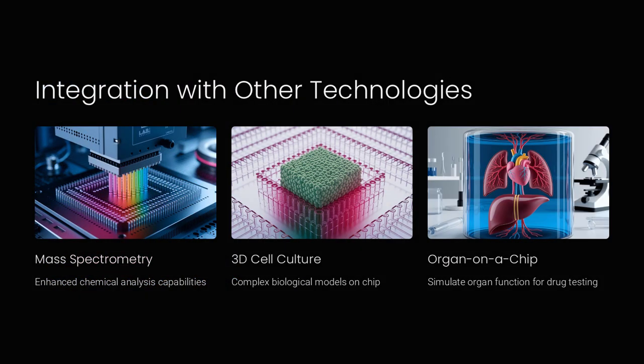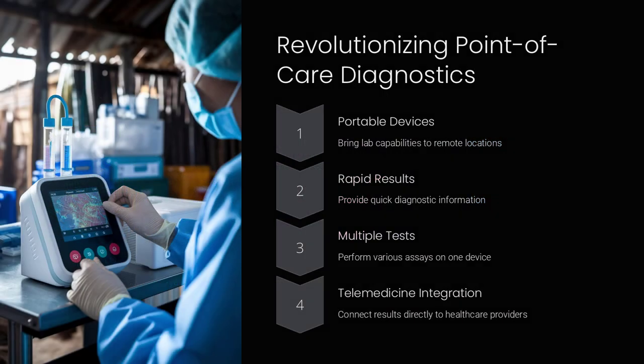Digital microfluidics has broad applications in both biological and chemical analyses, ranging from DNA amplification to enzyme assays. The platform's ability to precisely manipulate droplets allows for the execution of complex assays with high sensitivity and specificity, making it particularly useful in genomics, proteomics, and diagnostics, where small sample volumes and rapid processing are crucial. Its versatility enables simultaneous, multiple analyses, increasing throughput and data quality, and driving innovations in personalized medicine and high-throughput screening.